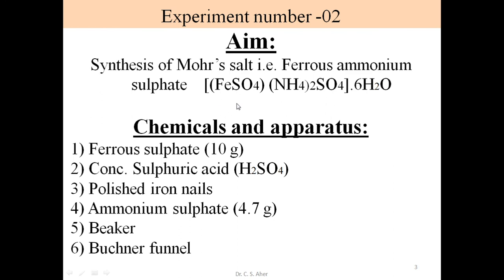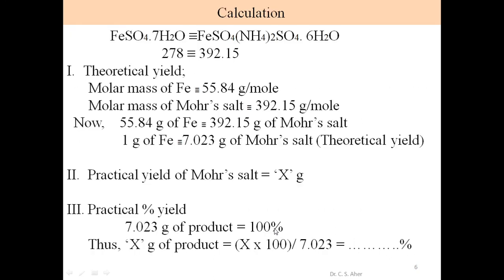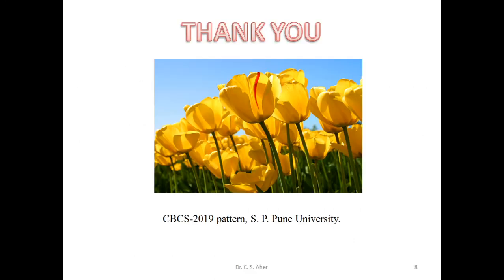But in that video, the person prepares ferrous sulfate separately and ammonium sulfate separately, and these two salts are mixed in one beaker to form Mohr salt. That procedure is different from this procedure, but that video gives an idea about the practical demonstration of this experiment. So, calculation, result. Thank you.